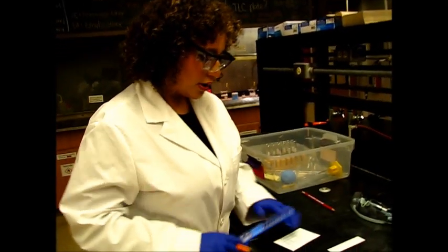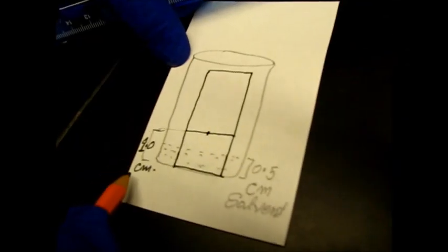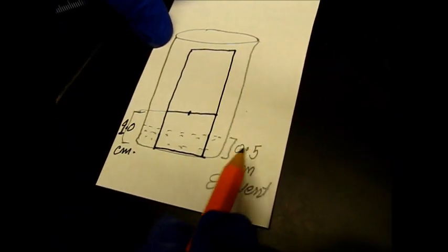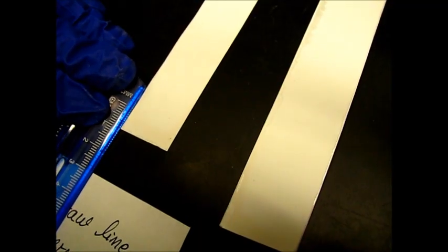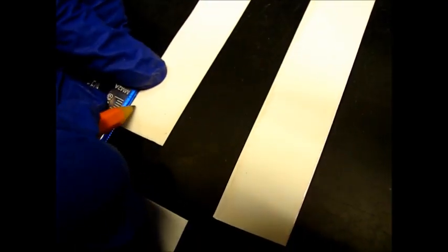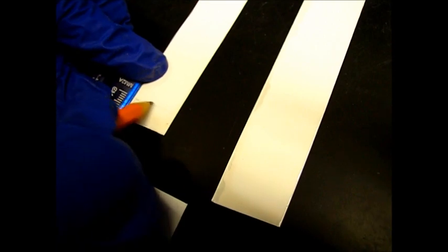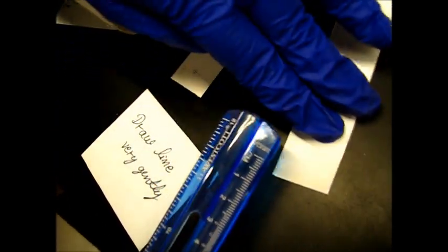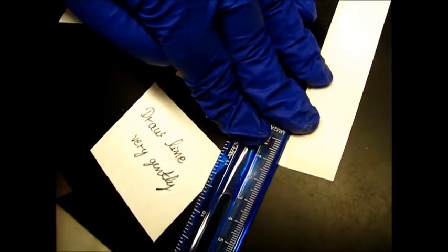Now we'll use the TLC plates. For our TLC, we want the origin of our sample to be at one centimeter, so it can be above the point five centimeter solvent line. We have to draw our line very gently. With our ruler, we're going to measure out one centimeter approximately and very gently draw our line. And right in the middle, we're going to mark our spot where our sample will be. We're going to do the same thing for all of our TLC plates.